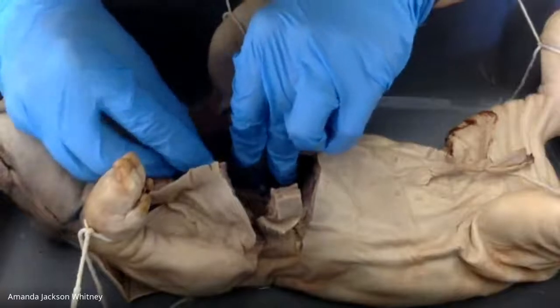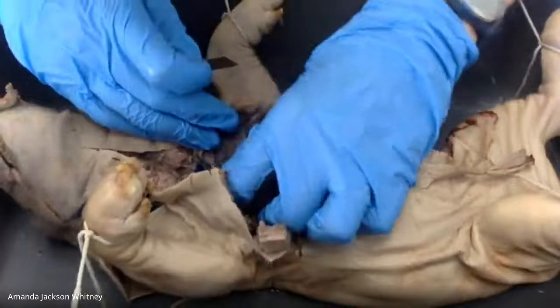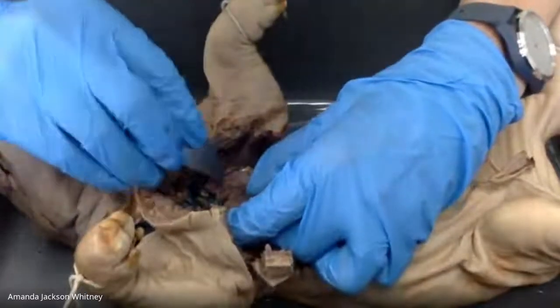I've been doing a very good job with dyeing their pigs here. So in order for me to take the heart out, I'm gonna have to cut away a little bit at the connections.